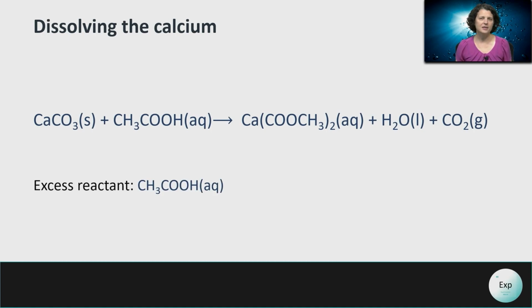For this process, it is essential that our excess reactant, the one that we use in an overwhelming amount, be the acetic acid. This ensures that all the calcium from the calcium carbonate is fully reacted.